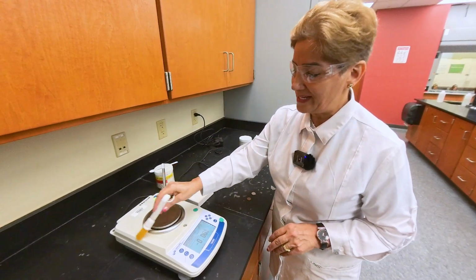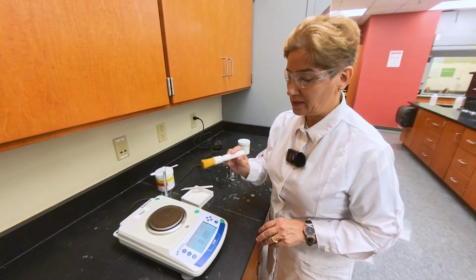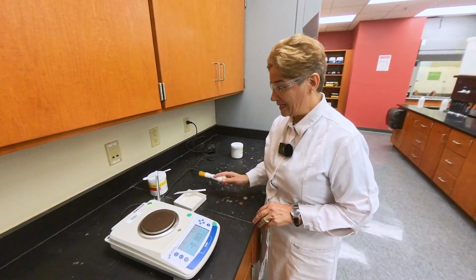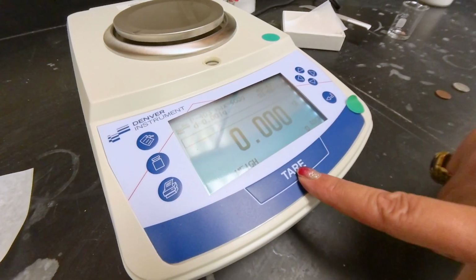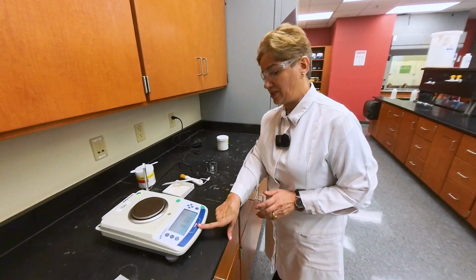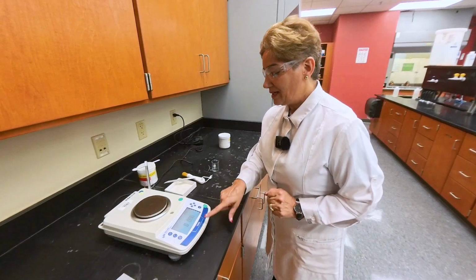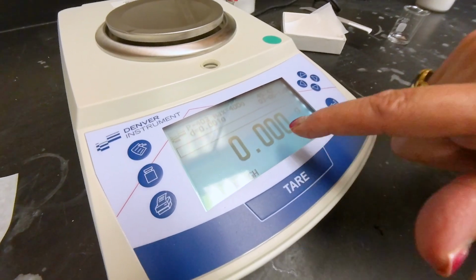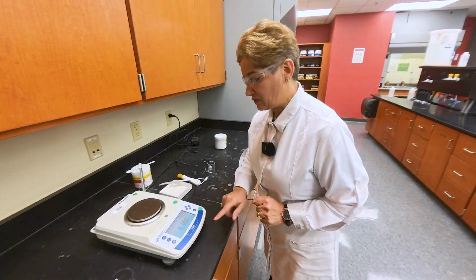Make sure if there is anything spilled, any powder, you remove it carefully and dispose of it in the solid waste. Just as a wrap up, here is the tare function whenever you need to use the tare for measuring directly or measuring out, and then changing the scale, like a measuring unit from gram to milligram or back and forth if the procedure calls for it.